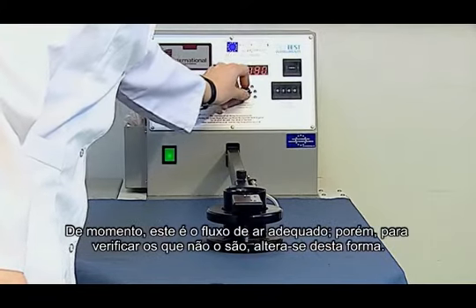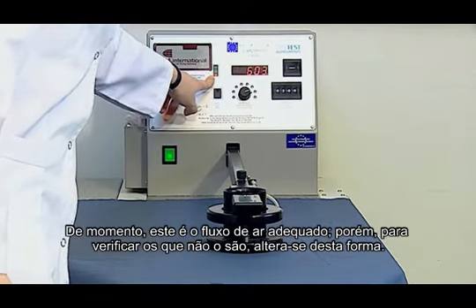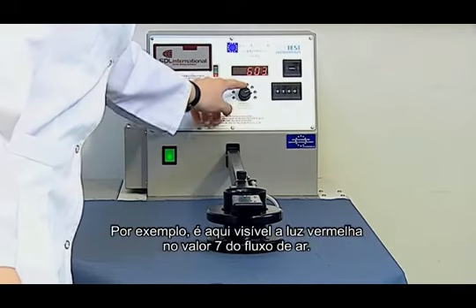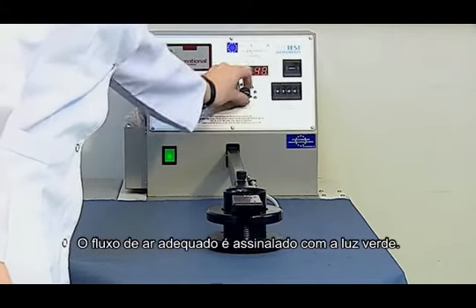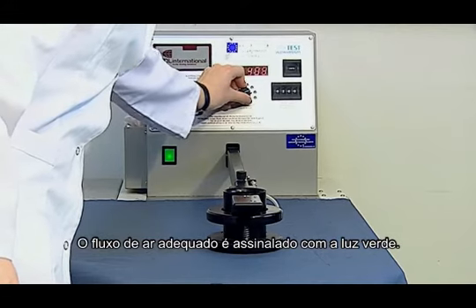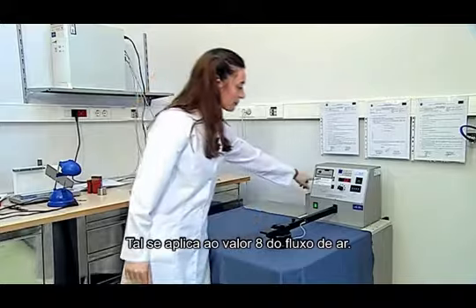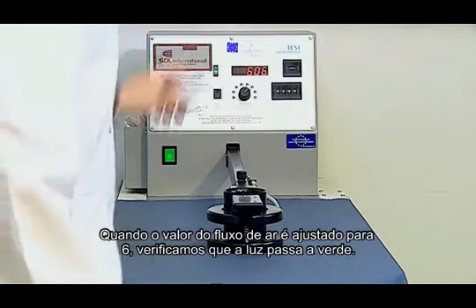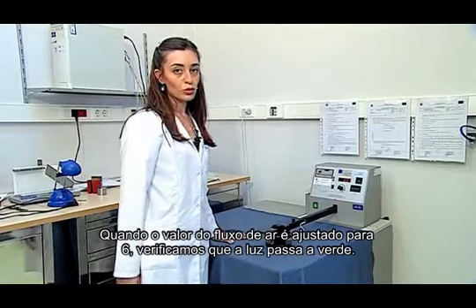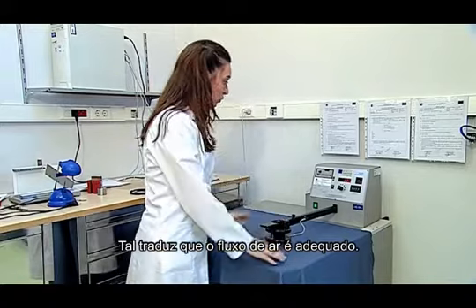At the moment, this is a suitable airflow, but to see those that are not appropriate, we change it in this way. For example, the red light is on here at the 7th airflow. To understand that it is the right airflow, the light must be green. This applies to the 8th airflow as well. When we adjust it to the 6th airflow, we see that the light becomes green. This shows that this is the right airflow.